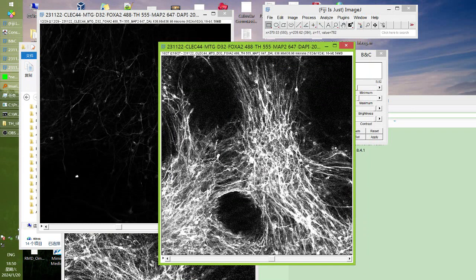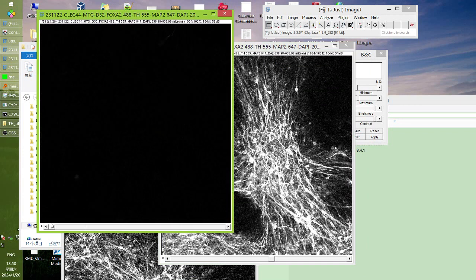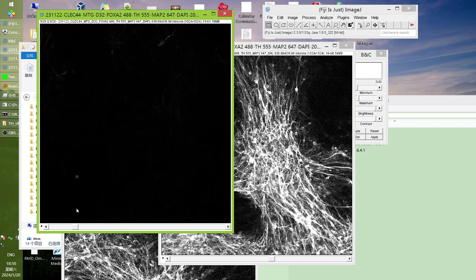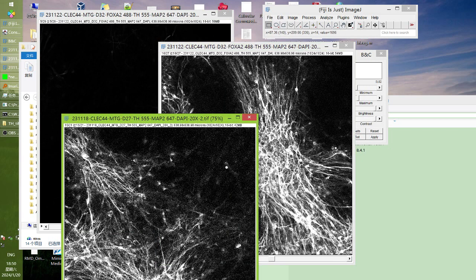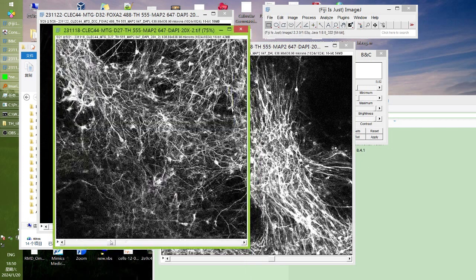The best way is that the slices have the exact number of slices, so that these different images could be merged along the time points, so that this will not cause confusion between the different files. You can see that this one has 29 images, this one has 27, this one has 21. So the slice numbers are not equal.